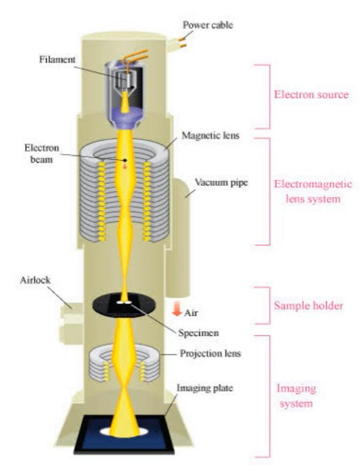So this is how the transmission electron microscope works.